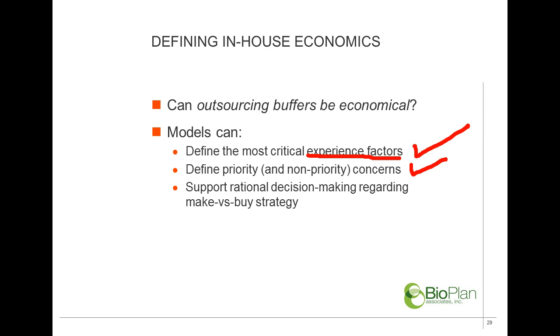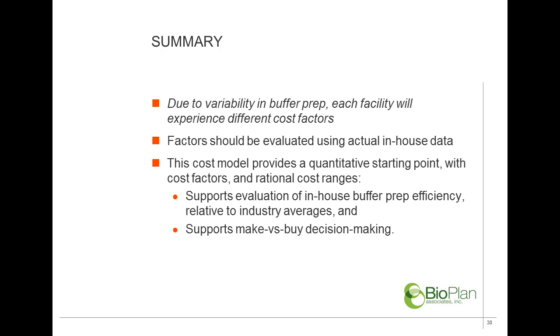Here you could at least put a number on those factors, and you can determine for your own facility whether this element or that element is a priority or a non-priority concern, and then move on to the more strategic issues. And ultimately, the objective of a model is to support a rational decision-making process in the make versus buy decision process overall.